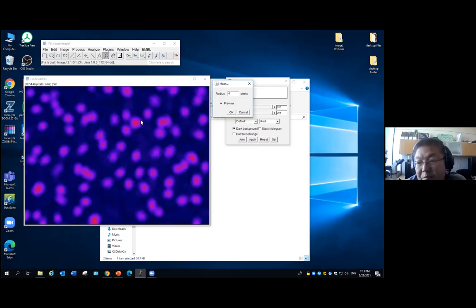So this is not the best way to solve the problem. We can do it this way, but again, I also want to emphasize this. Once you have your raw image, you do the image analysis, and you find some kind of disadvantage in your image, your best way is to go back to the microscope, get the best raw image you can, then you start your analysis.